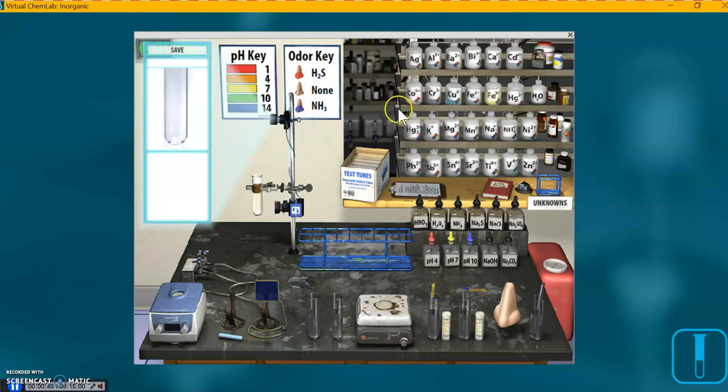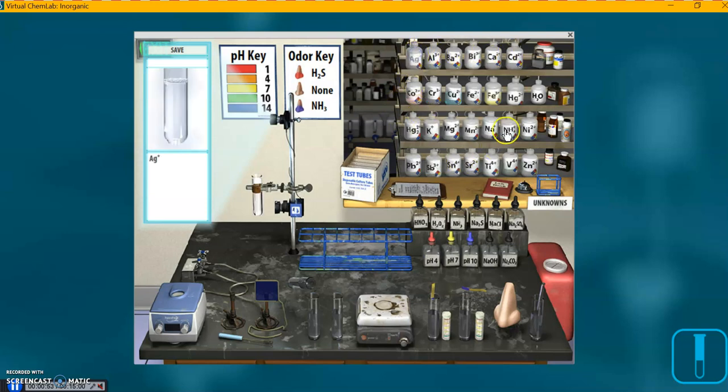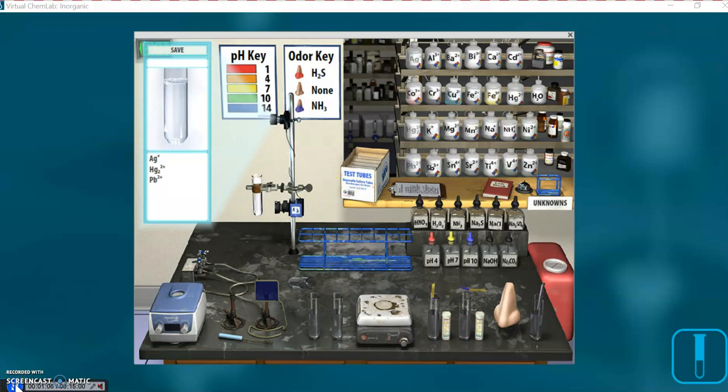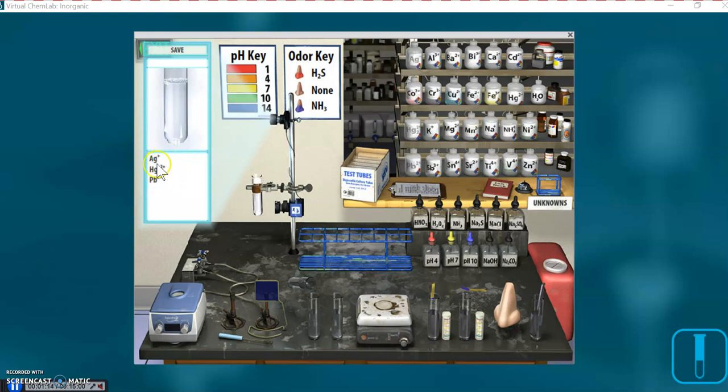And I'm going to grab our ions. Now that they're active, I'm getting Silver, Mercury. We have two options, HG2+, and HG2 2+, also known as Mercury-1. That's the one we want for this lab. Lead. Notice over here on the zoom-in screen, it tells us the ions that we just put in there, and any other ions or molecules that form while we're doing chemical reactions.